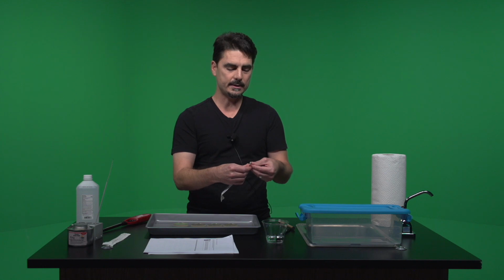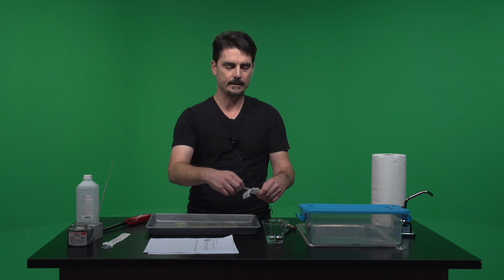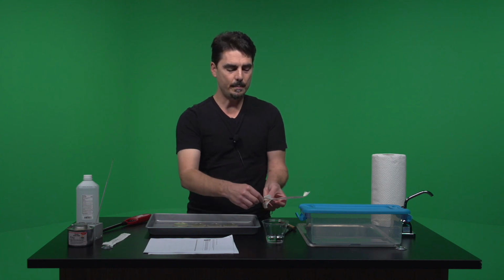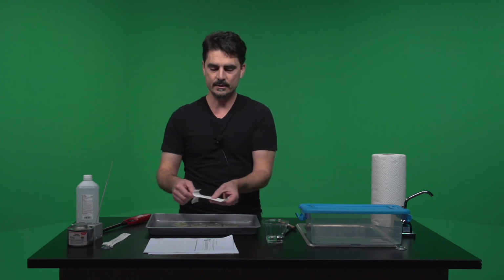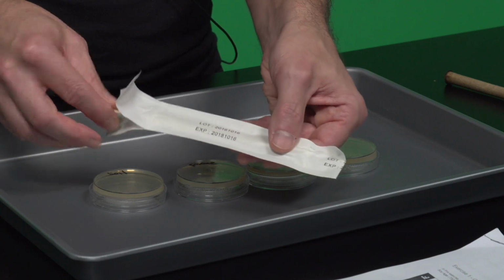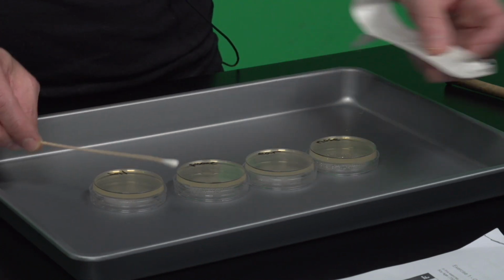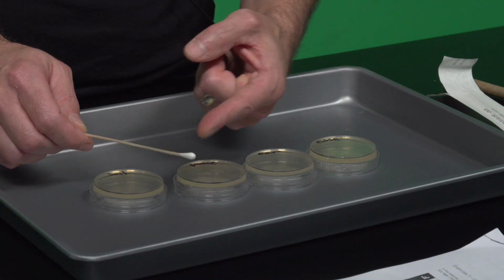Open them up like this, and only pull out one at a time. You're only opening it just a little bit so that the swab that's still in there stays inside, and when I pull this out, I can put the other swab to the side and I've got this one that's good to go.